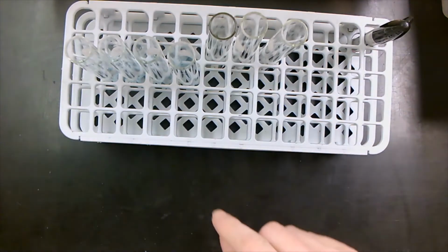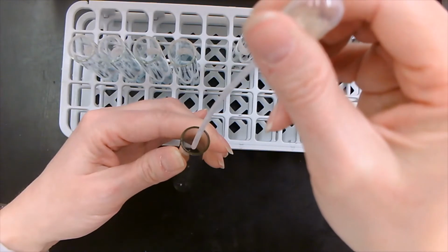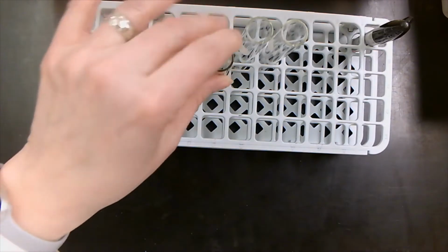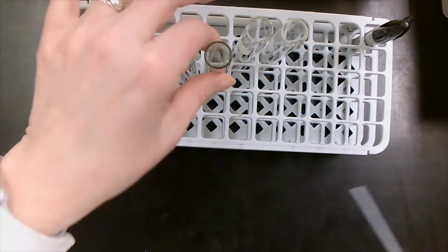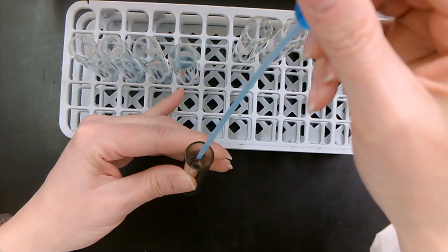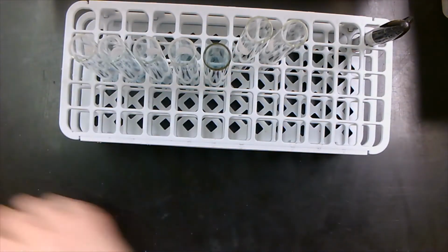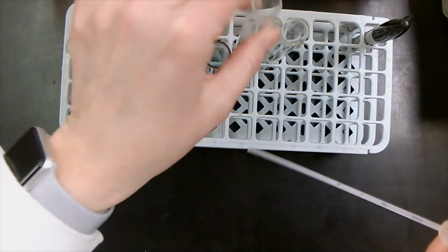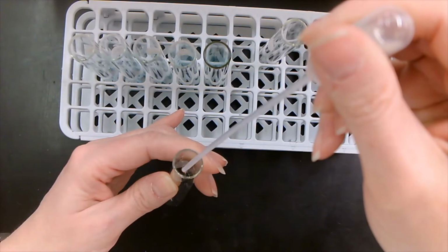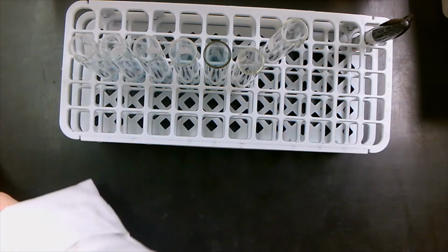The next test tube that we're going to be testing is brown sugar. So this is just our run-of-the-mill brown sugar. It's not cane sugar. It's not any specific special brown sugar. The next test tube we're adding is corn syrup. Adding the Benedict's.